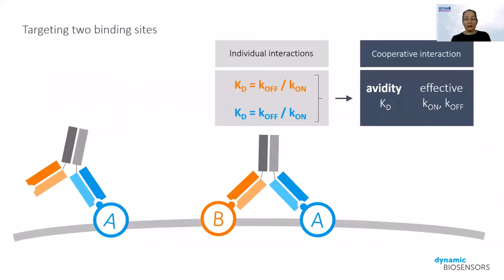When measuring binding affinities of antibodies, most of you will be familiar with the immobilization of the antibody on the sensing surface and then injecting the antigen solution. But in that assay orientation, you cannot measure a cooperative effect of two binding sites, no matter if we're talking about two equal or two different antigens. In contrast, in switchSENSE, we are immobilizing the antigen on the surface and use the antibody as analyte in solution.